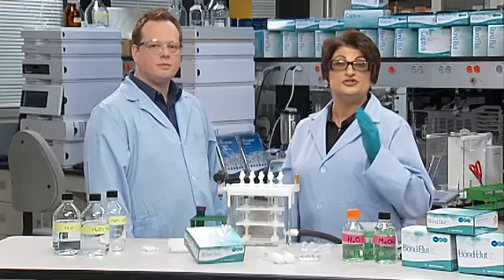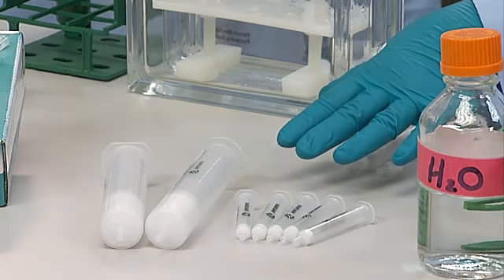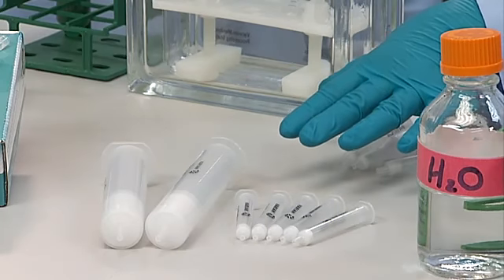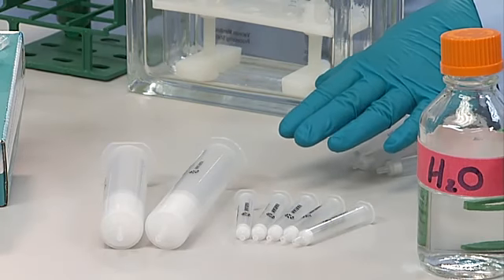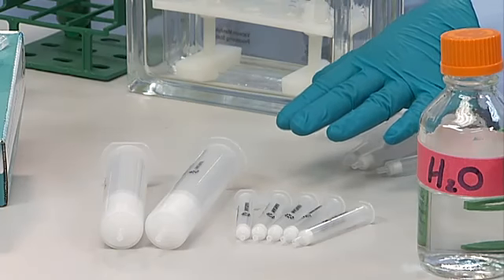There are 5 basic formats for packing solid phase extraction material. The straight barrel, also known as the syringe barrel, is defined as a 1 to 60 milliliter size barrel, indicated by the approximate volume that can be added to the barrel at any one time, relative to the packing material present in the barrel. The usual bed mass for this format is 30 milligrams to 10 grams.